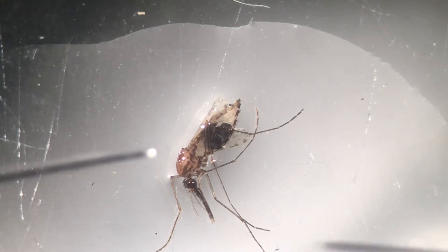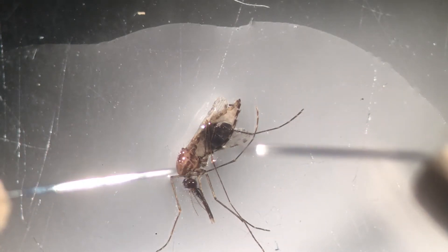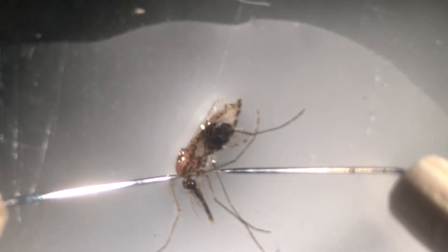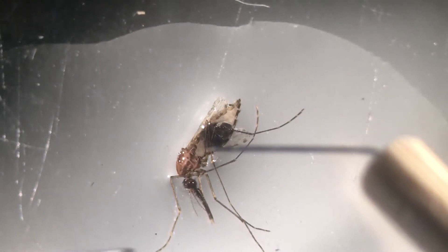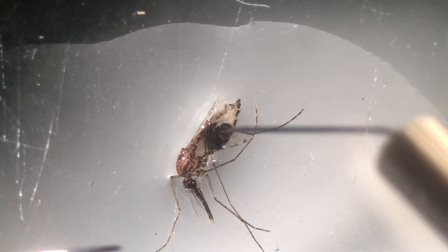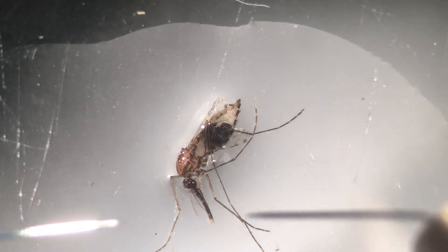This is the dissection of a female Anopheles gambiae, the mosquito responsible for the transmission of malaria. We're going to dissect the midgut, which you can see here, because this female was blood-fed a couple of days ago. This area here is the blood that has been digested.